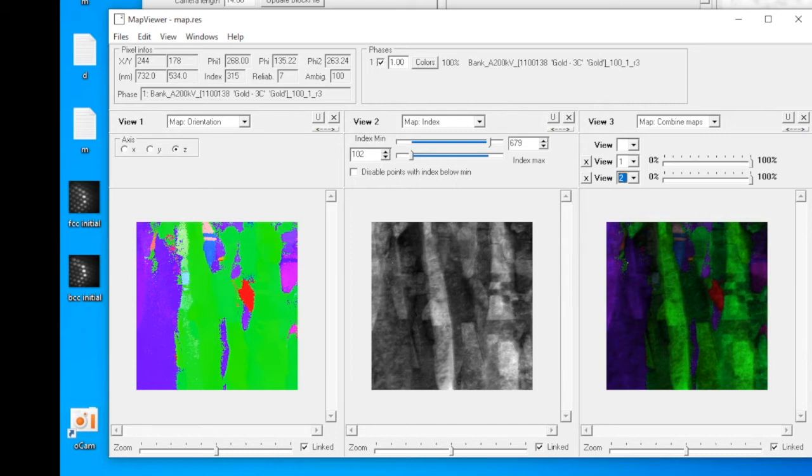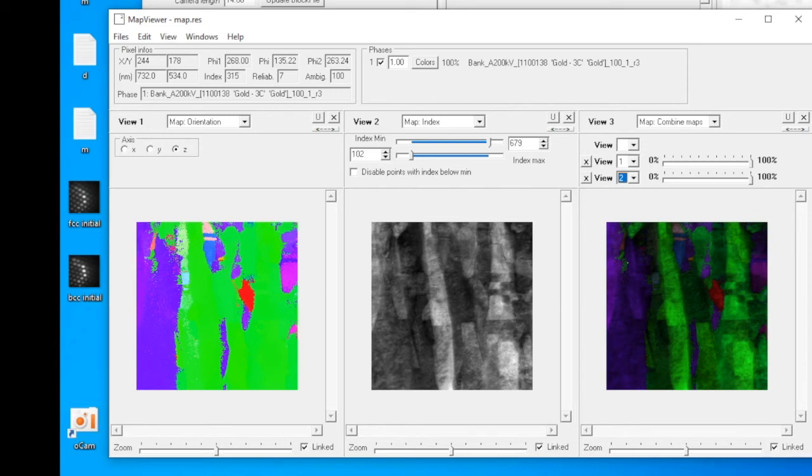This is a very short introduction of what you can do with the map viewer. There are a lot of parameters you can tune and a lot of things you can try. I strongly encourage you to play with the software and learn more through doing.